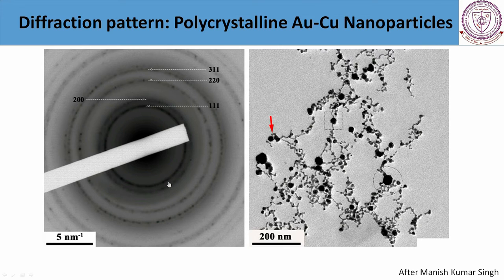And therefore, as you are able to see, this microstructure is at a length scale of 200 nanometer. If you think of the grains, they are hardly 10 to 20 nanometer or so. And these fragments have length scales further less, around 2 to 3 nanometer. So you can put the diffraction aperture over the whole region, and in case you record the diffraction pattern, this is how it is going to look.